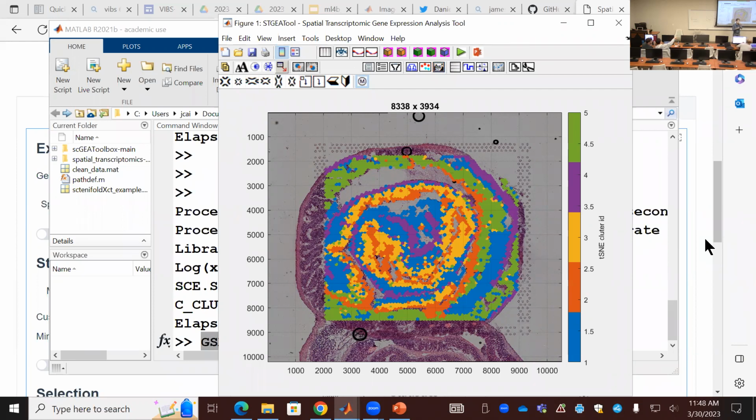We try to detect that information. So this is just one way we utilize those spatial transcriptome information that you can imagine if you have a real project, what you can do with this type of data. Okay. Any quick questions? Are we okay with this part? Okay.